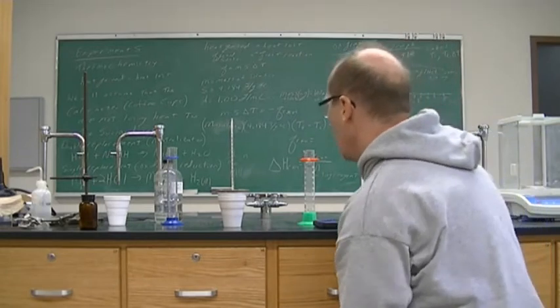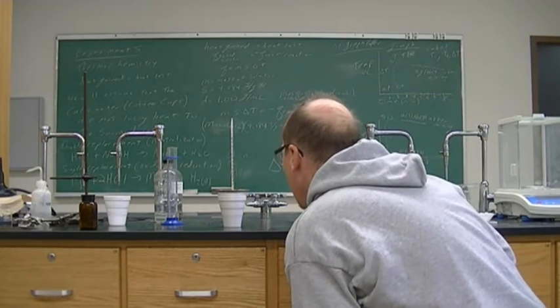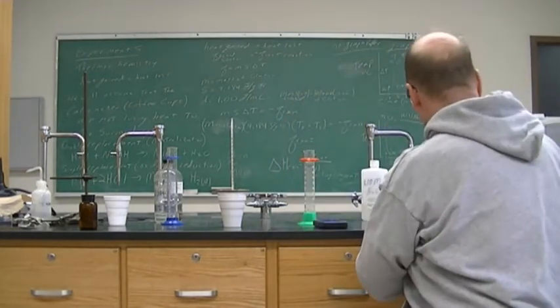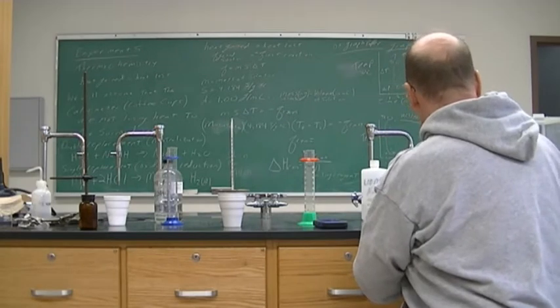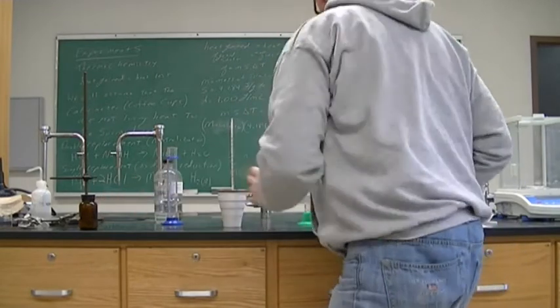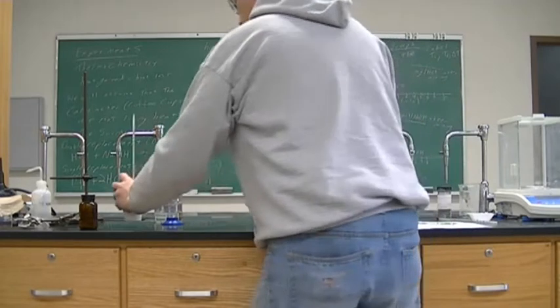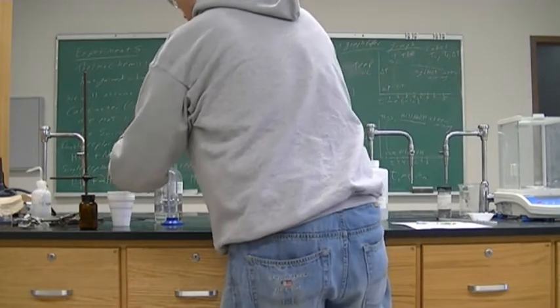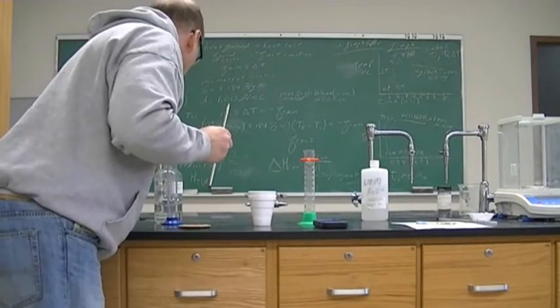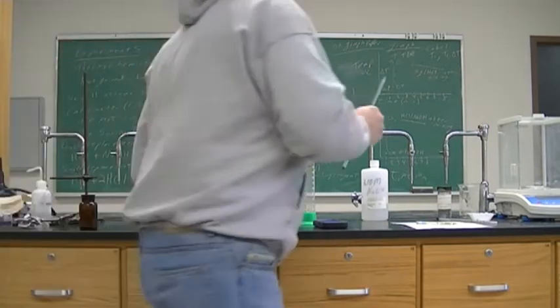All right, I'll go ahead and take the 4-minute mark because we're there, and we are still at 24.0. So even at the 4-minute mark, it is 24.0 degrees Celsius. So now we're ready for our second experiment. All right, I will let this one go over here. And so let's go ahead and use this one again. So this time we're going to take magnesium.